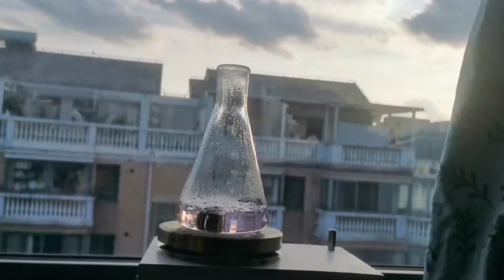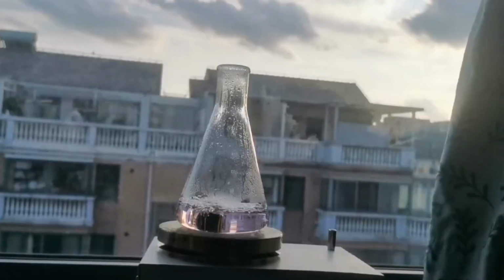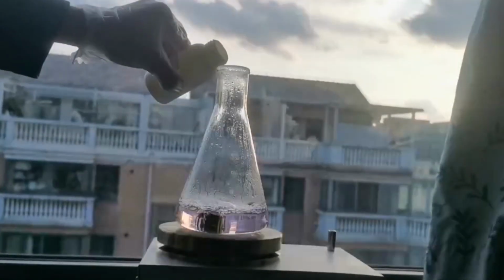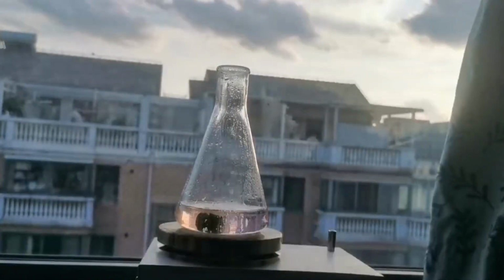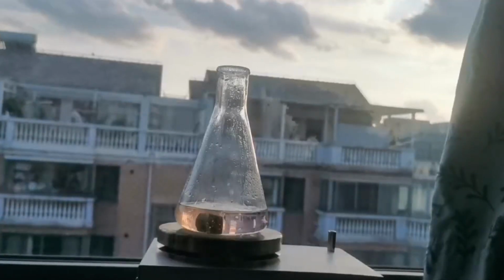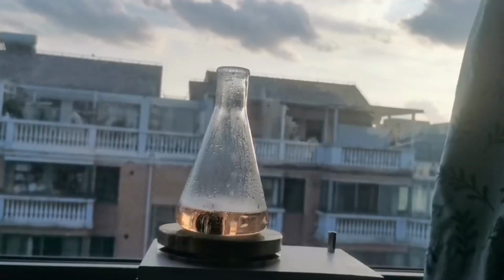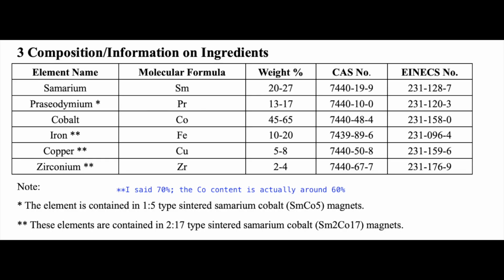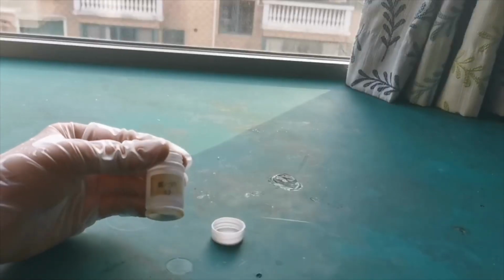A few months ago, I posted a video about extracting various lanthanide elements from a lighter flint rod. Following the project's big success, I tried to find other sources of lanthanides, and I stumbled upon samarium-cobalt magnets. They are the first generation of ultra-strong rare earth magnets and got superseded by the well-known neodymium magnets later. The main reason I chose samarium-cobalt magnets over neodymium ones on this project is that around 70% of the samarium-cobalt magnet is cobalt, a very interesting element on its own, while most of the neodymium magnet consists of boring iron. Anyways, let's get started on the project.